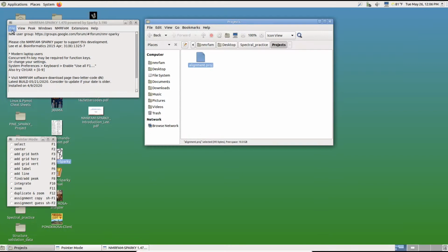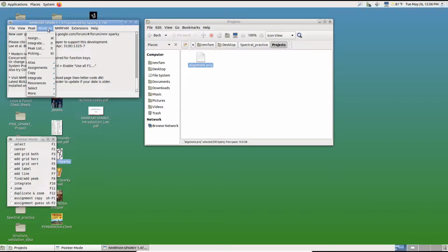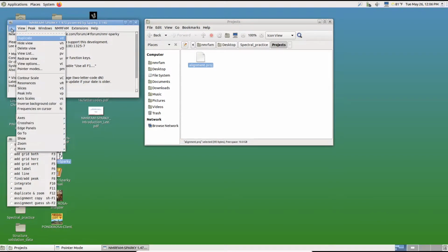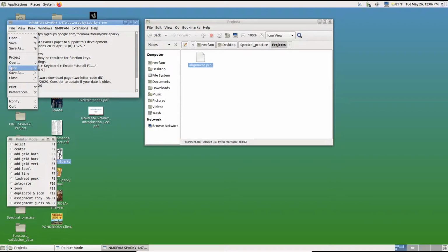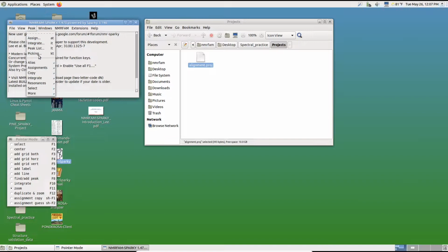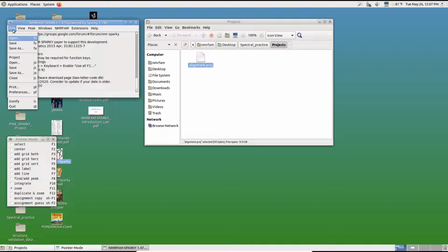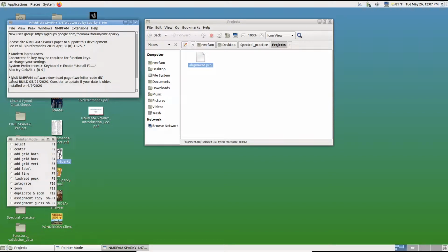In here, you can click one of them, and you can see the sub-menu items down here. Then you can just click on it, or if you already memorized the 2-letter code, then you can just type in this command window directly, like we did for capital R, capital E to change our Sparky home.